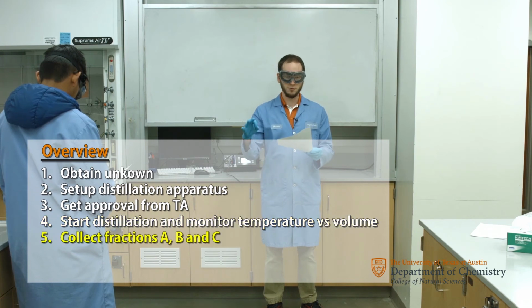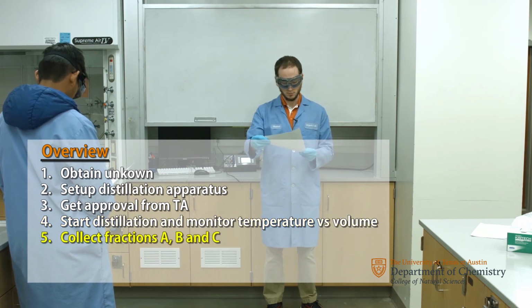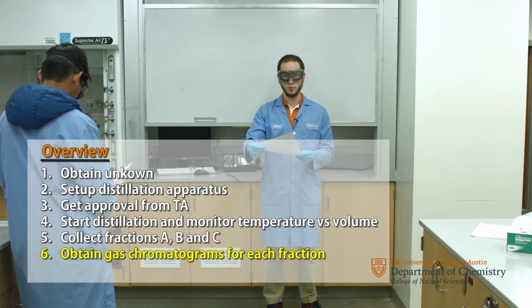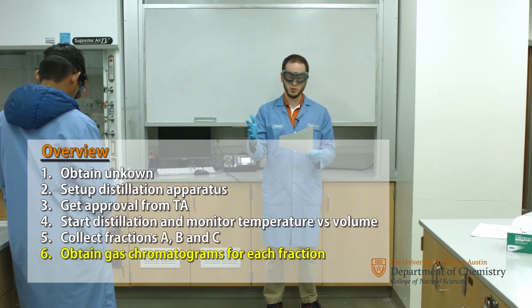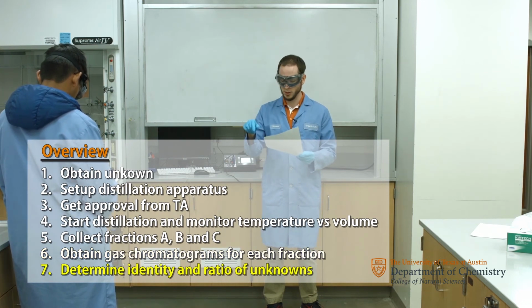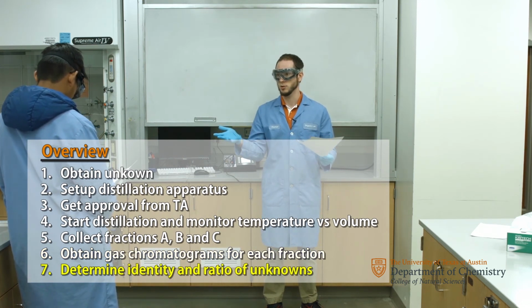You're going to be collecting 3 fractions, A, B, and C. Once they're collected, you're going to go ahead and get the gas chromatograms for each fraction. You'll use the retention times to determine the identities of each of the compounds, and you'll use the peak integrations to determine the ratios of the compounds in the original sample.